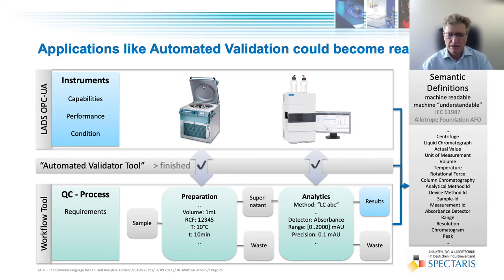The key is a machine understandable, standardized representation of the information found in the various systems involved, in this case the workflow tool and the instruments themselves. LADS OPC UA will bring this feature to the world of device connectivity.